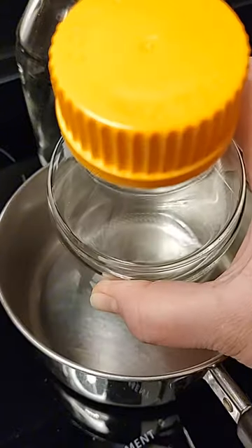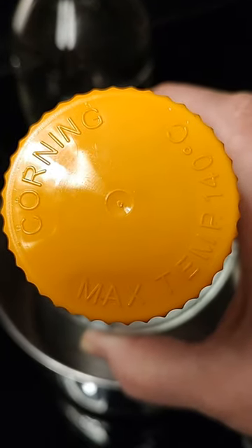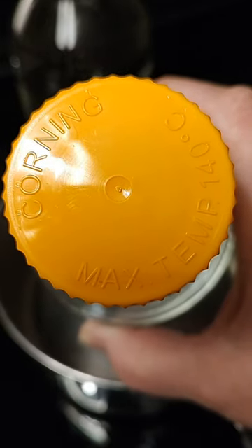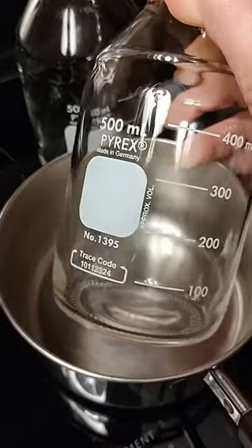We have a simple and easy how to create agar without a heated stir plate for you, the full length of video. We do highly suggest these jars, but you don't even need that either.